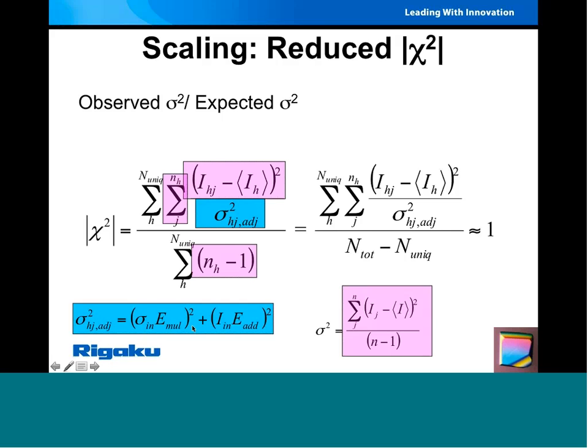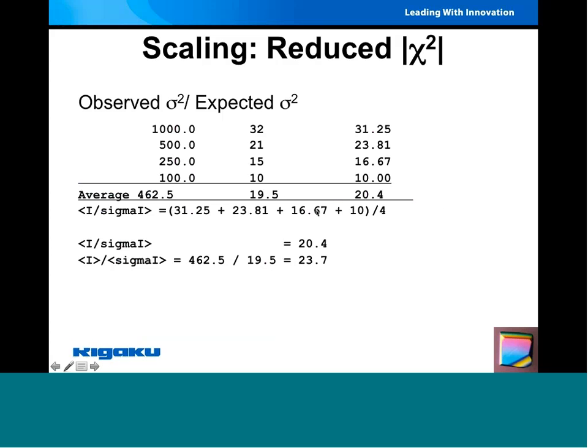And we have this sigma coming from Poisson counting statistics adjusted for the gain of the detector and a few other things. And if you take the magenta divided by the cyan or blue, if these are close to each other, they should be equal to 1. And this is the math for you, and in many places this has never been explained, so I want to show that to you here.